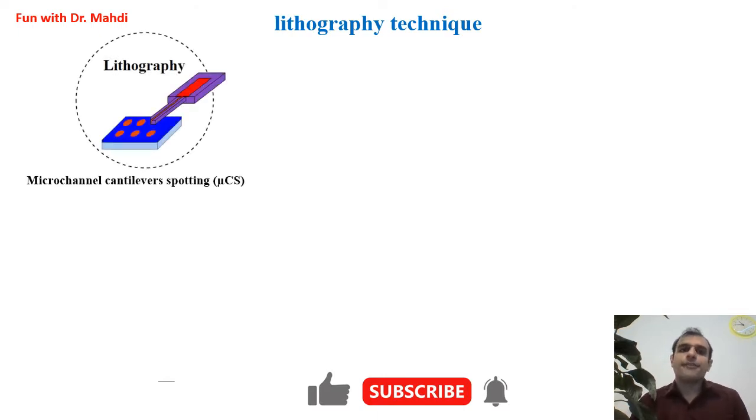For doing lithography and printing the molecule on the surface, we need to use this chip. This chip is called a microchannel cantilever. It's a very small chip, maybe 5 by 5 millimeters. At the end of this chip, there is a channel. This channel is very, very small and you cannot see it with naked eyes. The width of this channel is near 10 micron. That's why we call it a microchannel cantilever.